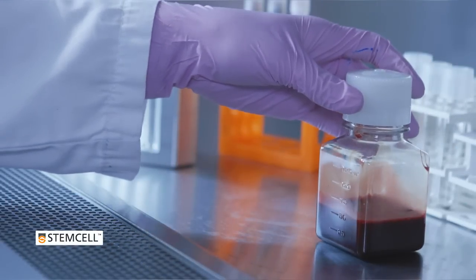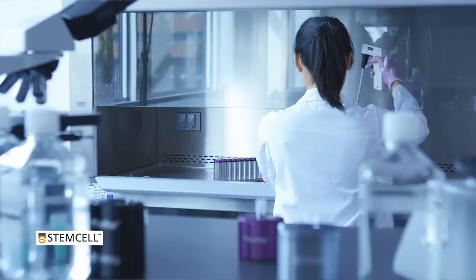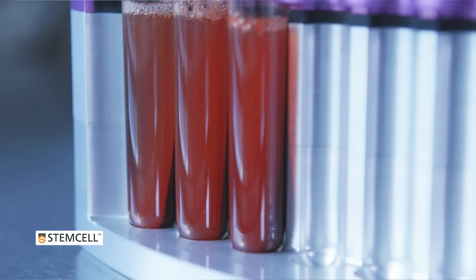EasySep Direct is a fast, column-free, and fully immunomagnetic platform for isolating cells directly from whole blood without RBC lysis, density gradient centrifugation, or other pre-processing steps.